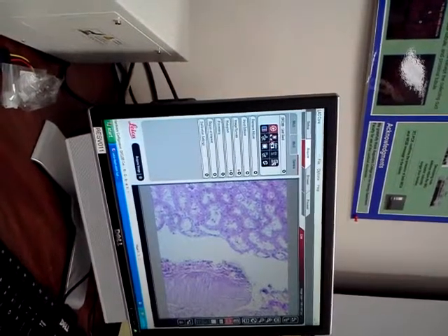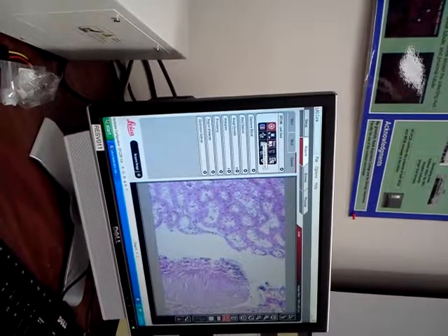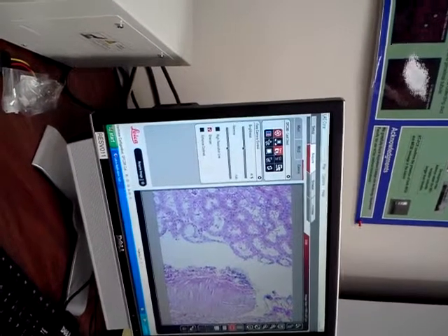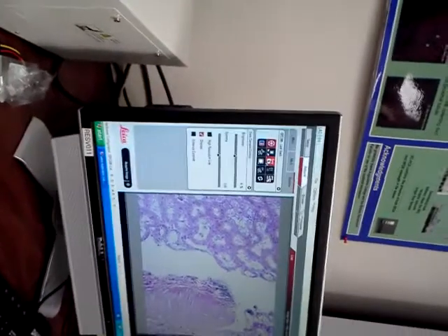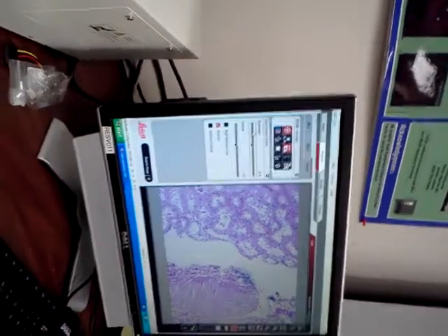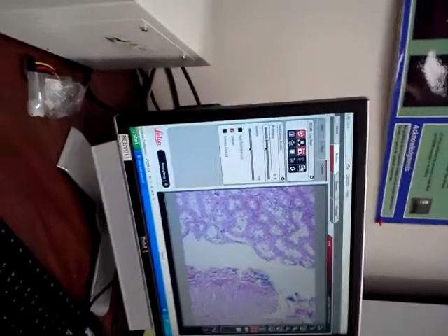Okay. The easy button is awesome. This is a new feature on the software. It just makes it very simple. Let's say an undergrad for whatever reason comes in here, then all you get is brightness control, and that's it. Just very, very simple.